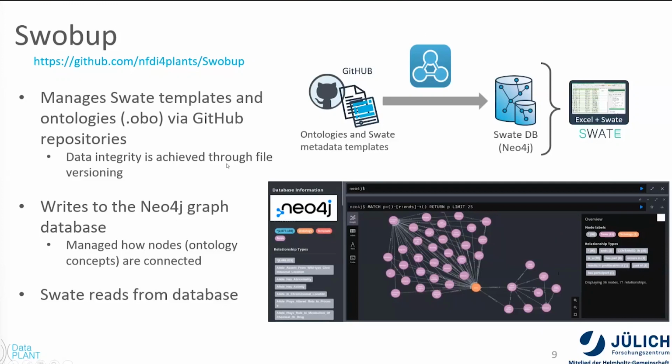And basically, this whole concept that we have here allows us to directly use any term or ontology that is added via GitHub directly within the Swate tool.